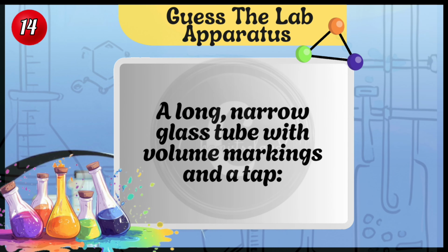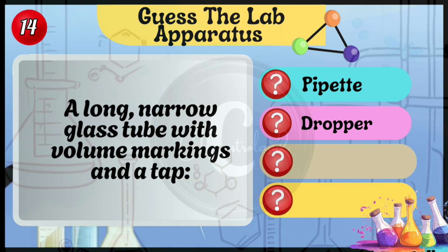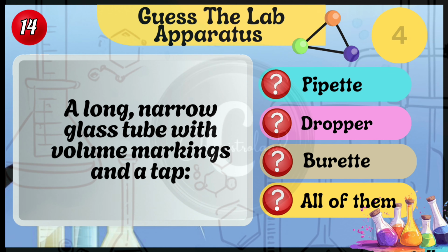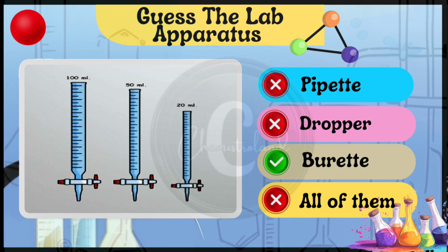A long, narrow glass tube with volume markings and a tap. Pipette, dropper, burette, or all of them. Burette is the right answer.